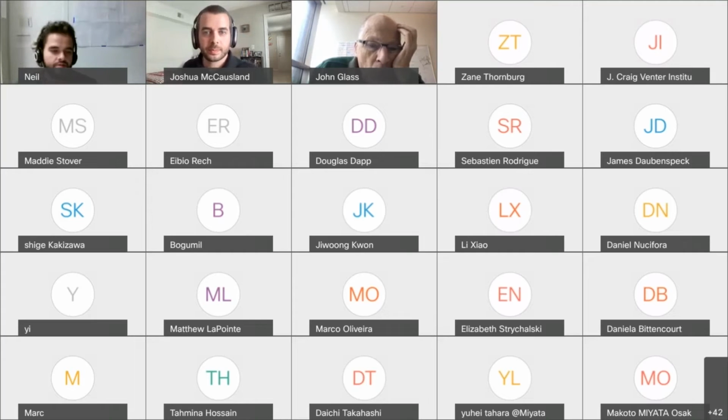This is SP4 with knockout as opposed to SP4 with FBS. Yes. SP4 knockout.